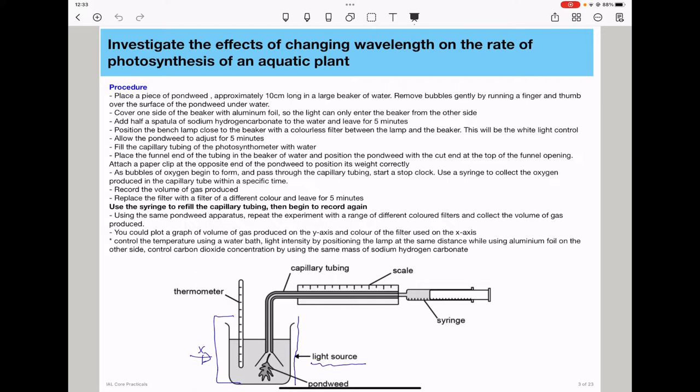Then attach a paper clip at the opposite end of the pondweed to position its weight correctly. As bubbles of oxygen begin to form and pass through the capillary tubing, you need to start the stop clock. This is done to ensure that we can measure the time for which the experiment has been carried out. And then you use a syringe to collect the volume of oxygen produced in the capillary tube within a specific time.